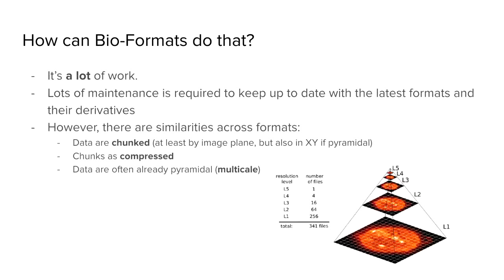So how does this all work with Bio-Formats? The answer is that it's a really large open source project that takes a lot of maintenance in order to support, I believe, over 150 different vendor formats, to keep up to date with both the latest formats and also some of their derivatives as well.